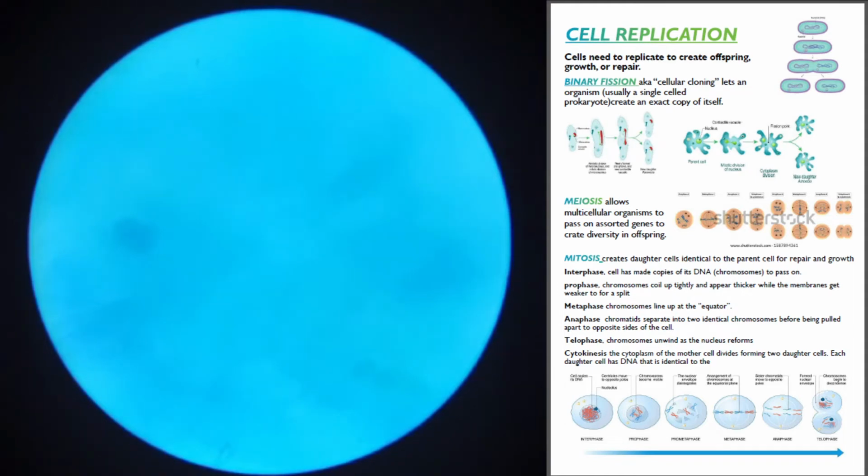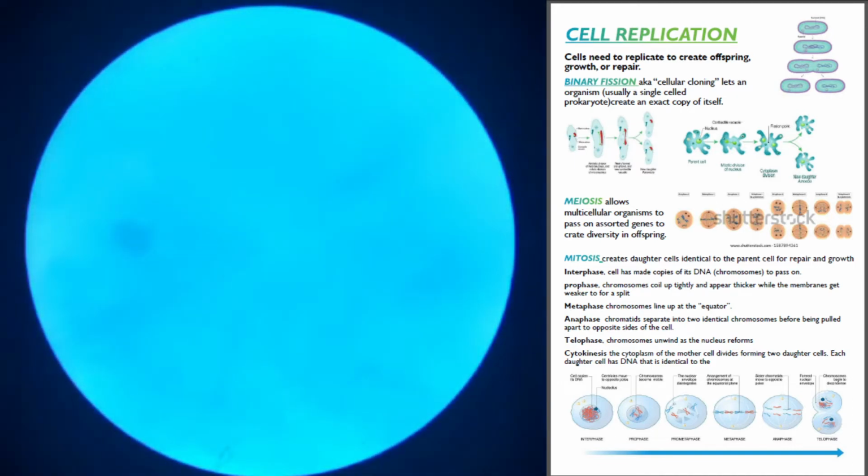Underlighting on. Adjust my rheostat, see if I can adjust how much light there is. My autofocus on my camera is still messing up. So it looks like I'm not going to get a good picture with my autofocus on. Oh well. So here are a couple things you can do.